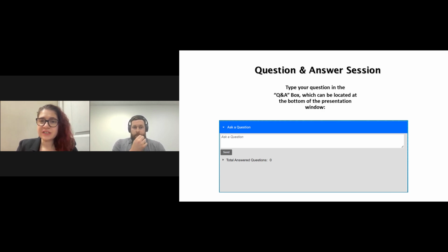Great. Okay, next question is, does the tablet have to be used on site, or is it possible to use it via remote control, like if you're traveling or have a home office set up? Currently the tablet is tested to connect directly to the instrument, interfacing with a USB or Ethernet connection. We are testing options for remote support. We have other software already released, like LabSolutions CS, or Client Server, that allows you to build a network of instruments and computers, which will give you more direct access to not only that instrument, but more instruments from a remote location.